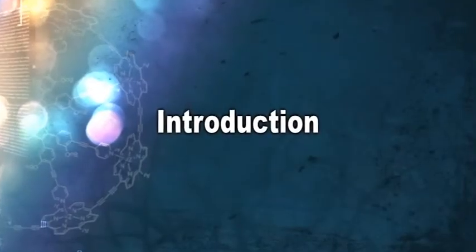Dear students, we will learn about DNA profiling of plants in this practical lecture. Let us start with the introduction.